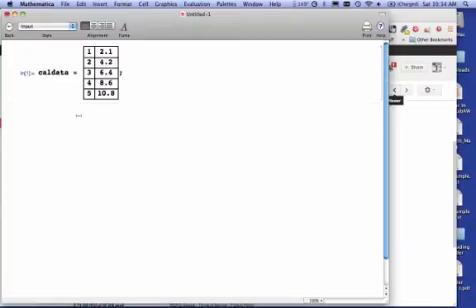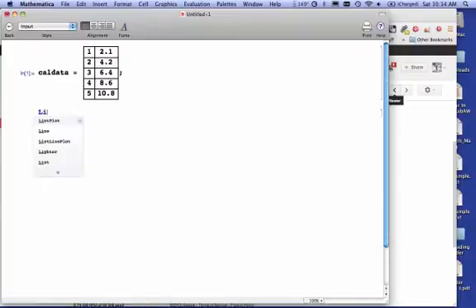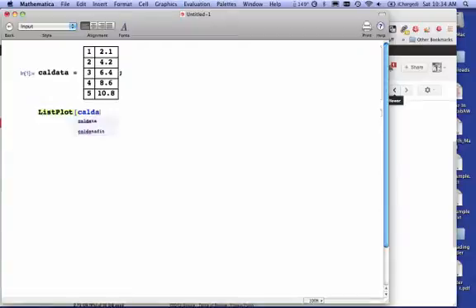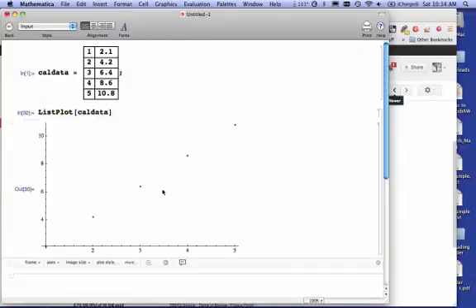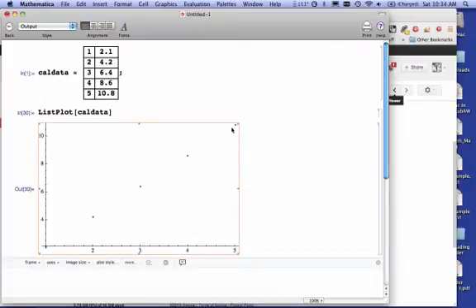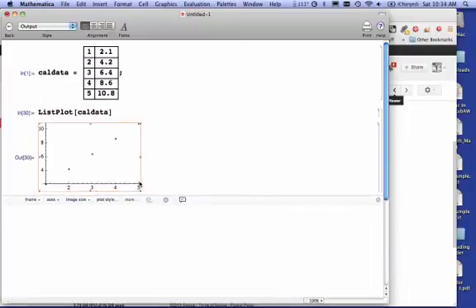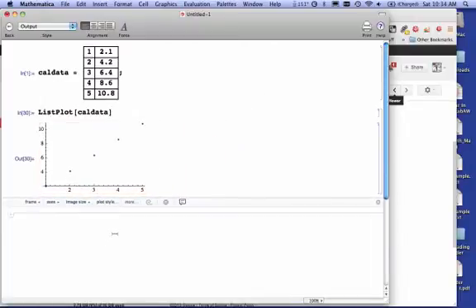So the first thing I want to do here is I want to plot this data to make sure that it is indeed linear, so I'm going to do a quick plot. I notice that it is linear. So I can now go ahead with the next step.